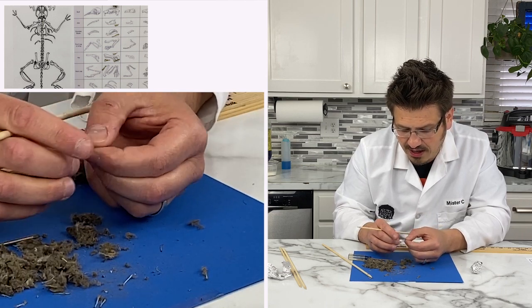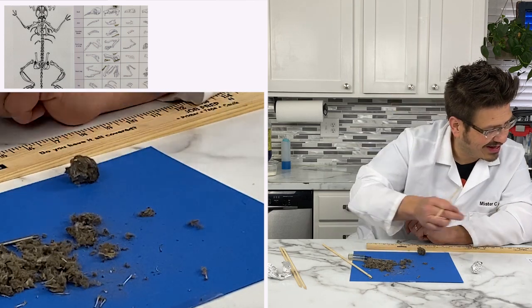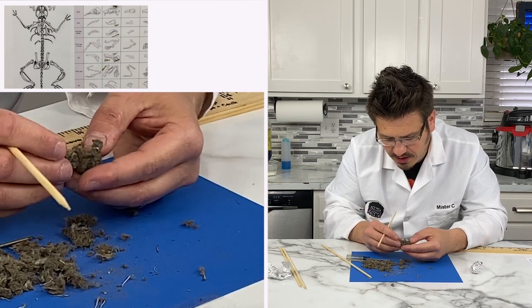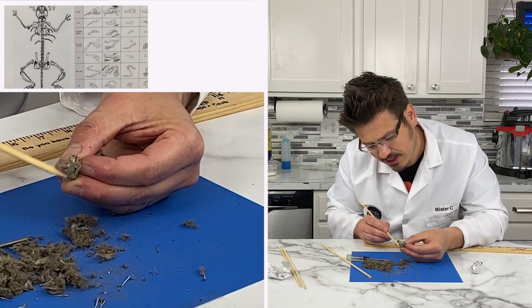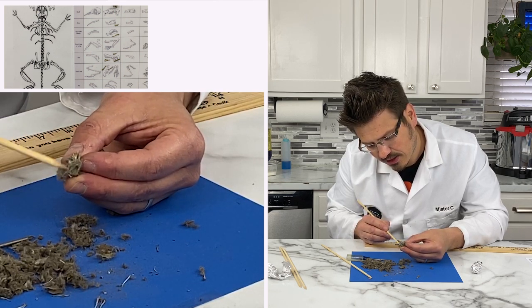How lucky am I to be able to dissect an owl pellet with you guys today? All right, I found another part to a back leg. Let's see what we got here. Oh, I was hoping. I think I found the other half to the jaw right here. You'll see it coming out right there. See that? There it is.